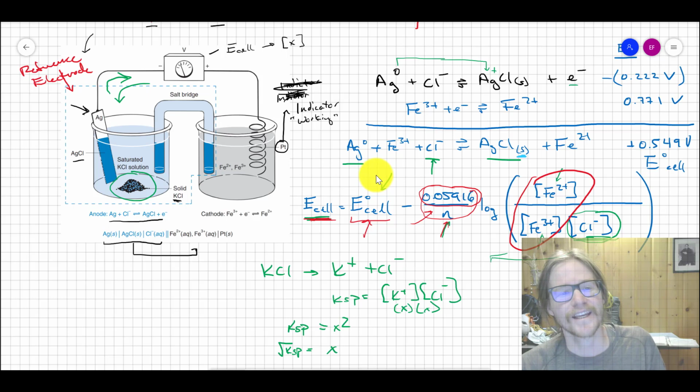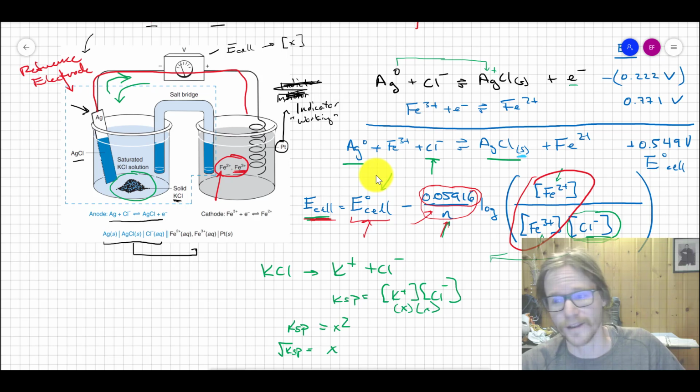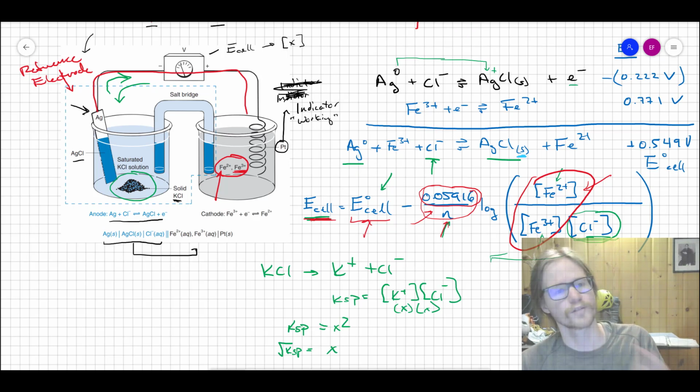Because then we can just take that silver and measure it against another electrode in a beaker, and the only thing that's going to change the voltage of that cell is what's in the system. Even better, if you don't have two unknowns, if you know one of those, then the only thing that's changing the cell potential is the unknown, which we could then back out of the Nernst equation, which is how metal ion sensors work. So let me show you what a real reference electrode looks like, so you could build it this way if you want.